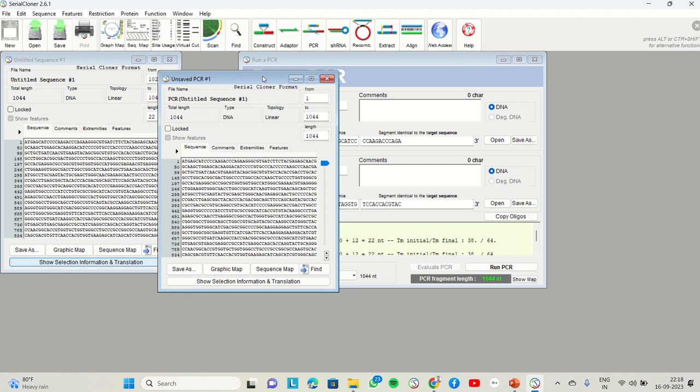So experimentally it is a highly laborious process, but in silico designing of the primer and verification before ordering would be very easy for any researcher to do.